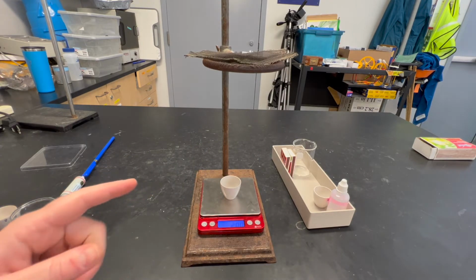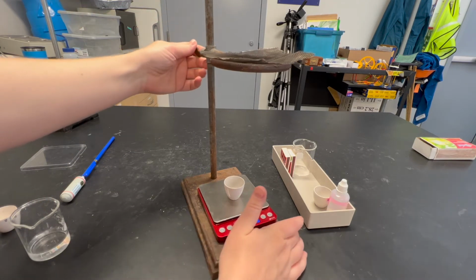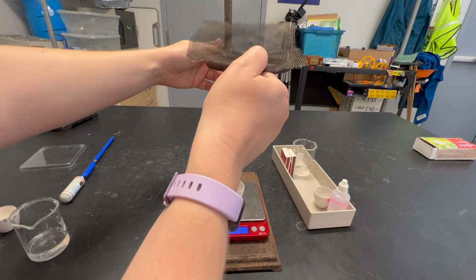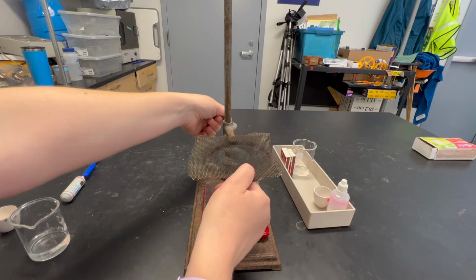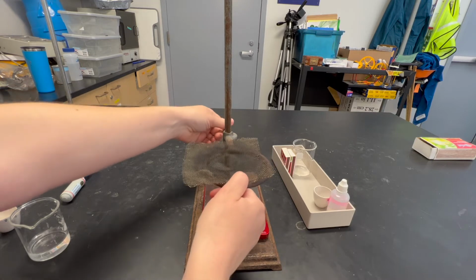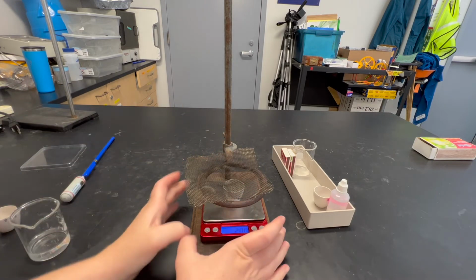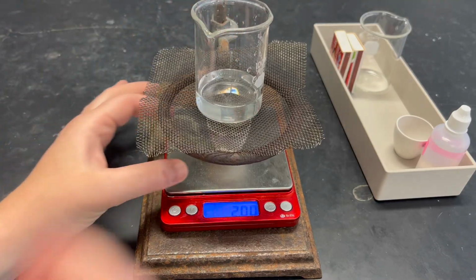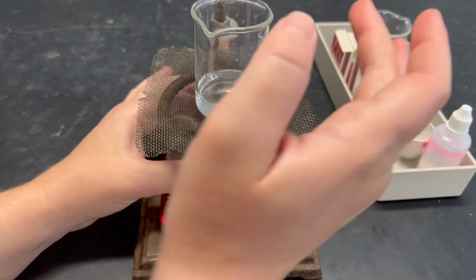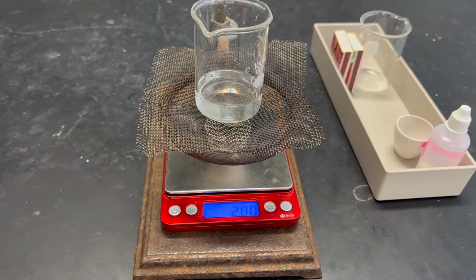The first thing that you want to do is adjust the ring. Unscrew the screw at the back, carefully holding the ring at the top, and you're going to move it down until you're pretty close to your ethanol. Adjust it so it's in the middle, and place your water on top, and look from the side and try and make it so it's pretty close to being directly under your water.